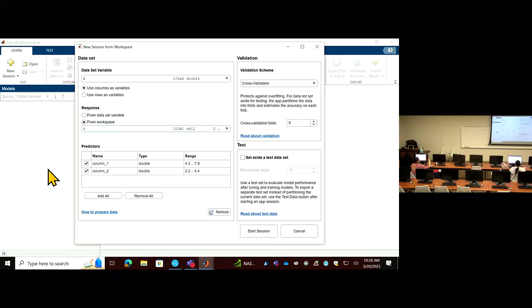So we are just doing the same thing, just like you use a command line to do, but it just provides an interface for you. Now you select S as your variable. Oh, you have a Y. Saved as Y. Okay. Yeah. So should I start?